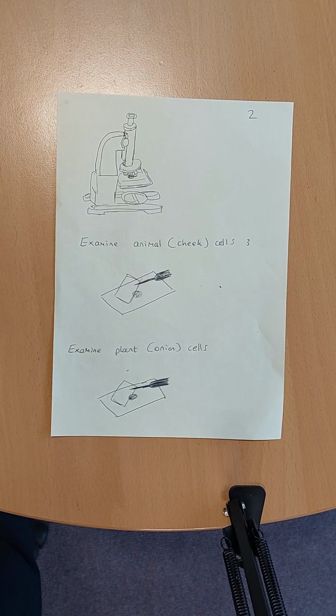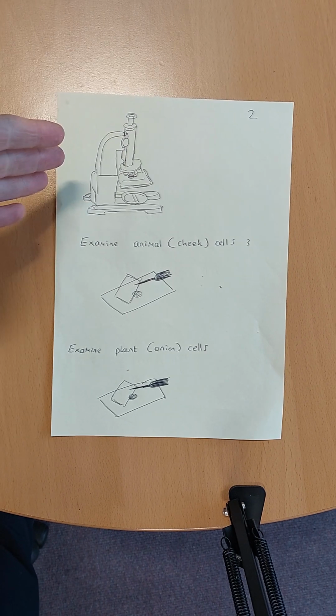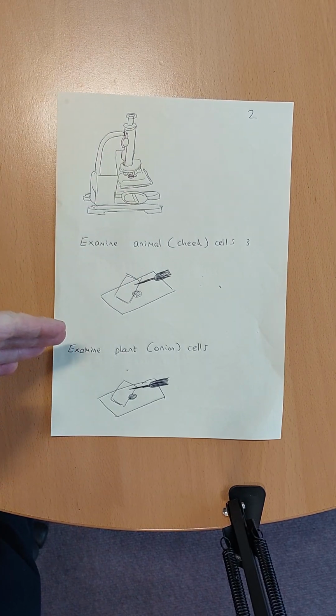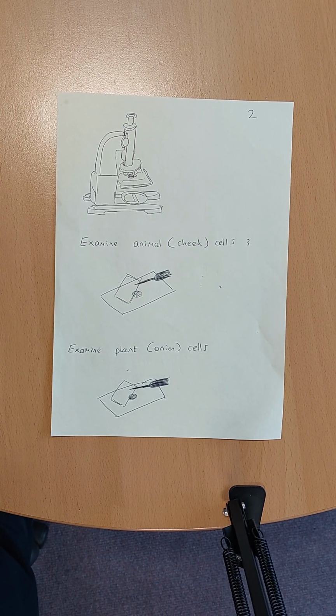Right, so if you look at the last video where we just talked about the microscope, the light microscope, there are two types of experiment that you've probably seen or done in school. One is looking at a cheek cell of an animal, and the other one is looking at a plant cell, probably an onion cell. What you might need to do is just be able to describe what happened. Fortunately we've got a lot of similarities, so let's have a look at those first.